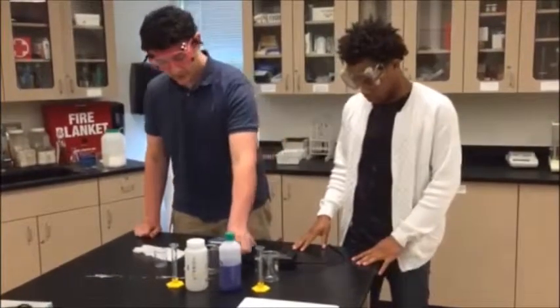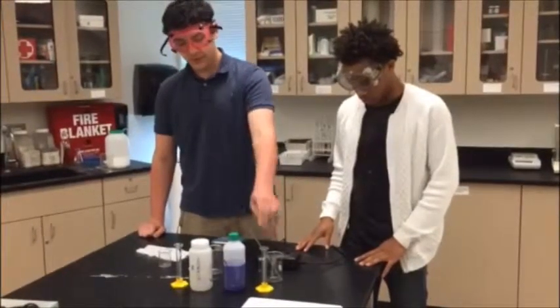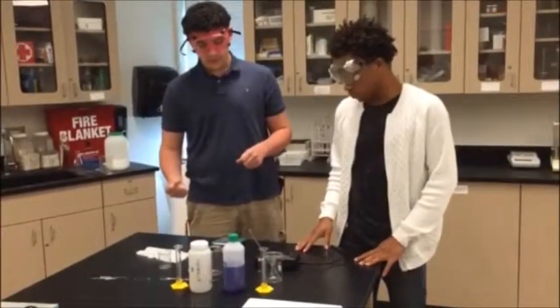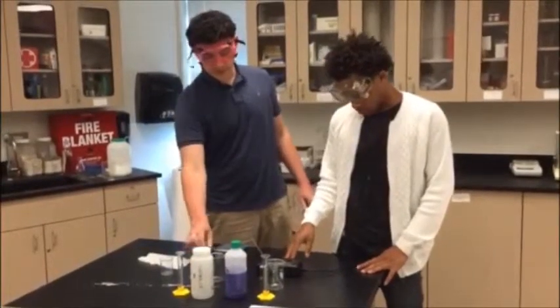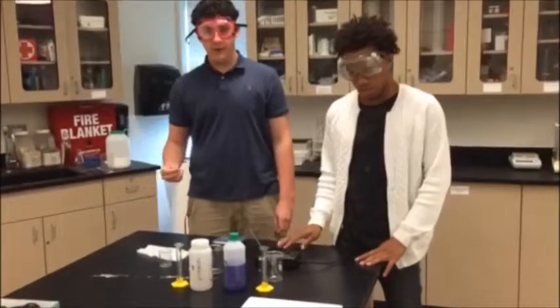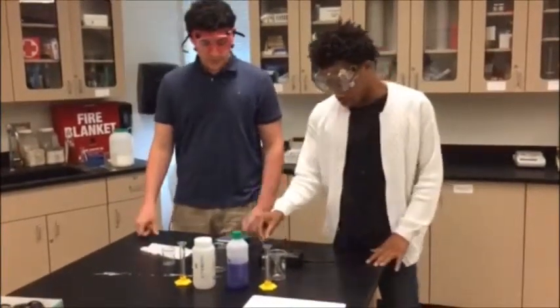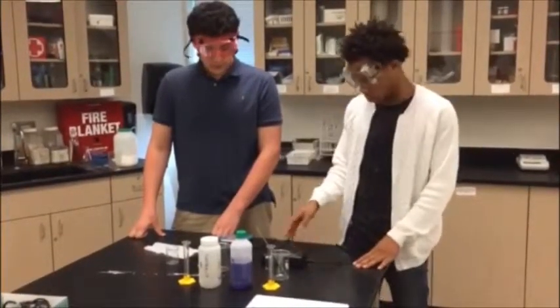And then after that, we would take 10 milliliters of the crystal violet solution into this beaker and 0.1 molar NaOH solution into this beaker, mix them together, and then pour them into another cuvette. From there, we would wipe that cuvette down, place it in here, and measure an absorbance versus time graph for 3 minutes with a 1 second interval. You want to make sure that when you mix the NaOH and the CV together, you're being very quick so that you get the reaction right.